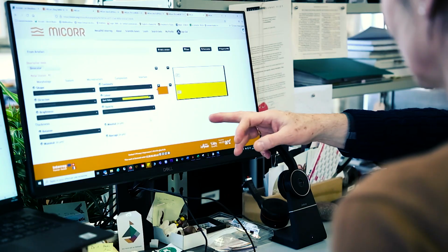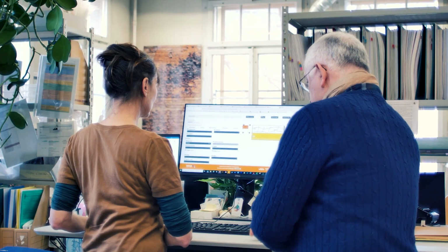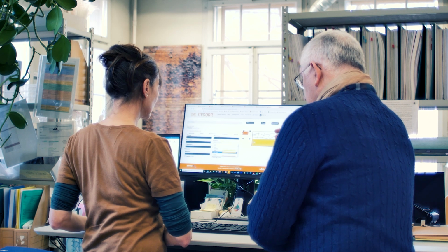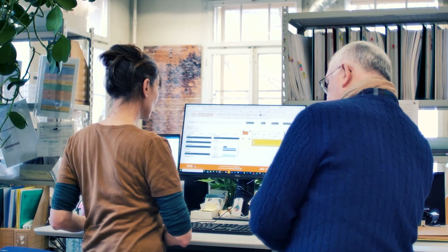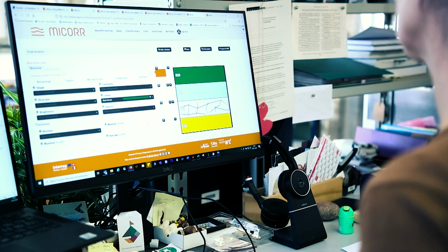So for the color, it's visible. You see the color, but sometimes it's not visible. So you will have to fill all the information related to each stratum, and then you will build slowly the whole structure you have seen. But you understand that it's an abstract way of representation, and that the tool can read.